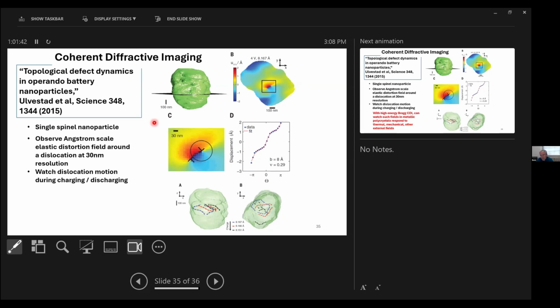We couldn't bring that near field detector as close as possible to the sample, and that inherently blocked the whole basic idea of how near field imaging works to determine the grain positions. So there are some limitations, but now I get it.